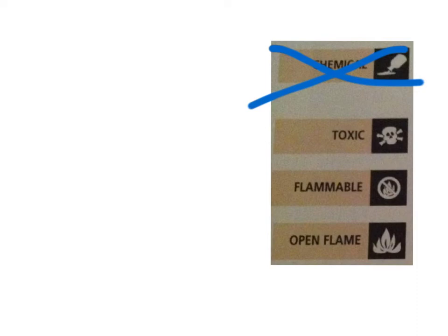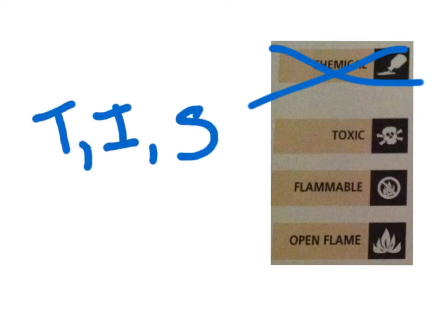Alright, so we already talked about chemical on the other screen. Alright, then toxic. This one you guys should know without me ever having to say anything. Toxic means that the substance may be poisonous if it's touched, inhaled, or swallowed.